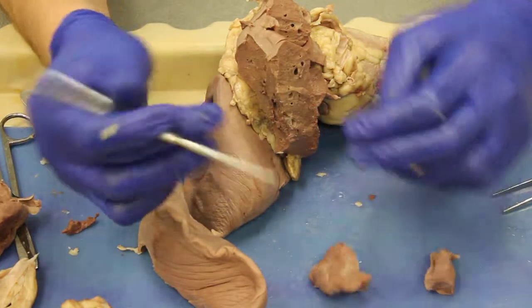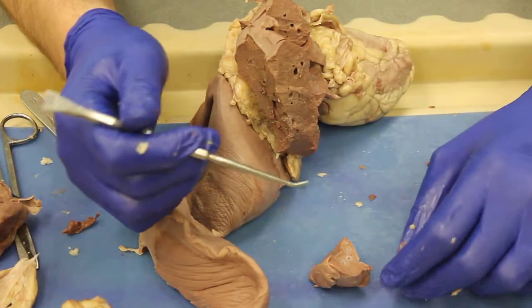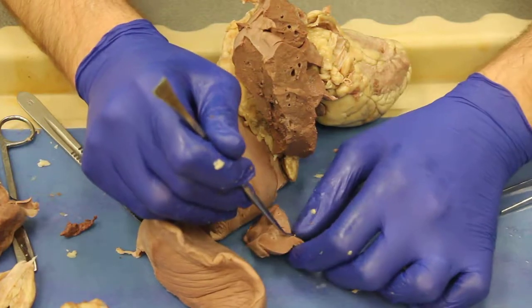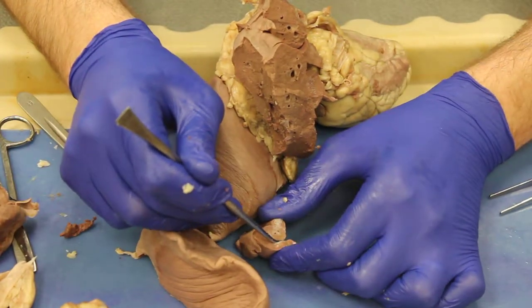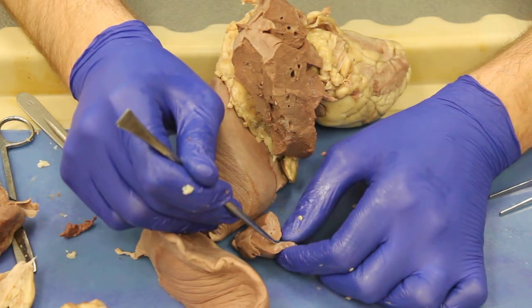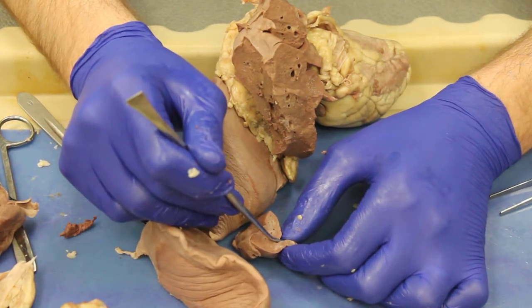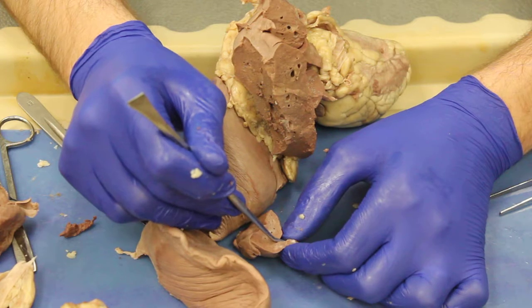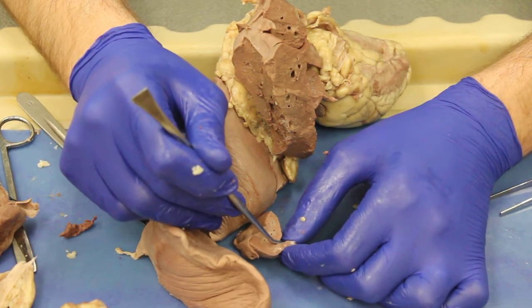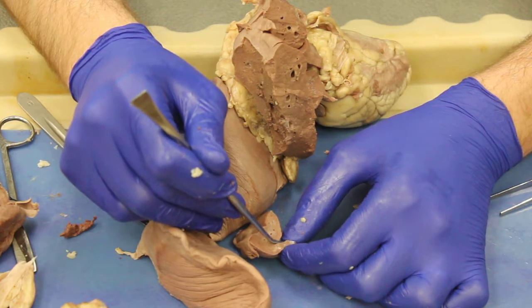Now, that's the difference that I want to expose here. If I don't have quite so many holes, then there's not quite as much goopy secretion. In an area where I have just alveolar tissue and terminal bronchioles, I don't see all that white stuff, and I just see clear liquid.